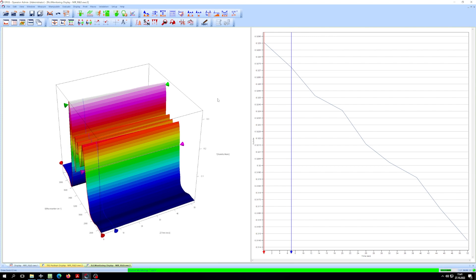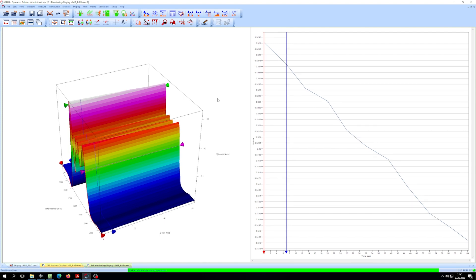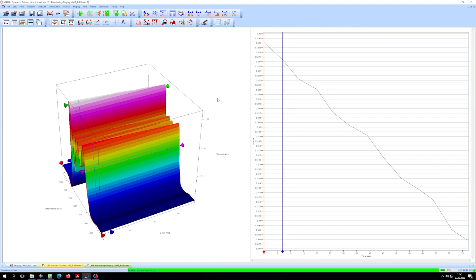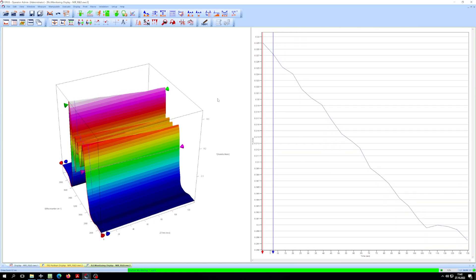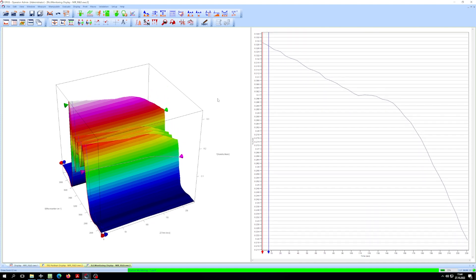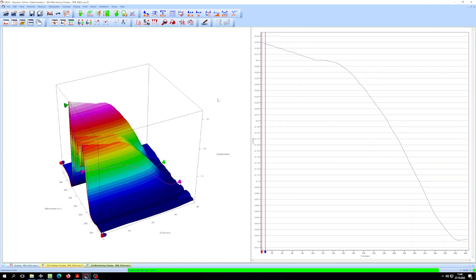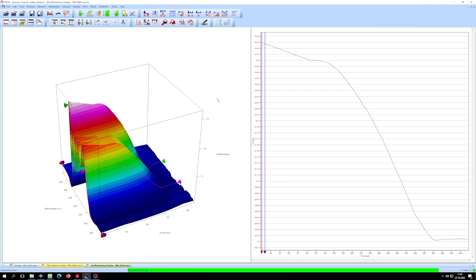We started with data acquisition at 80 degrees C and applied a heating rate of 10 degrees C per minute. At the beginning, we can already notice a slow and continuous decrease of the OH bands, which can be attributed to powder reconstruction and removal of ambient moisture during heating. The actual dehydration reaction starts after 2 minutes, where the band intensity starts to decrease much faster until it is almost reaching 0. This indicates complete dehydration after another period of about 4 minutes.